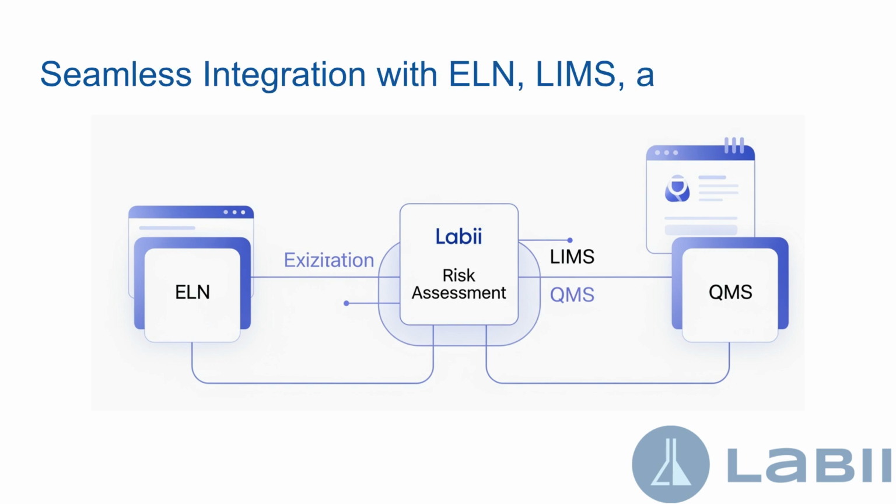Seamless integration with ELN, LIMS, and QMS. Associate risks with experiments, production runs, deviations, CAPAs, or SOPs. Labii's interconnected platform ensures risk awareness is embedded across your operations and scientific workflows.